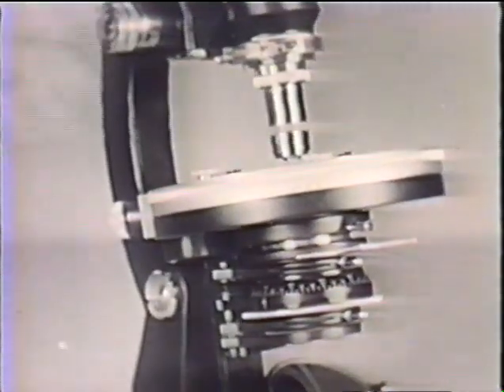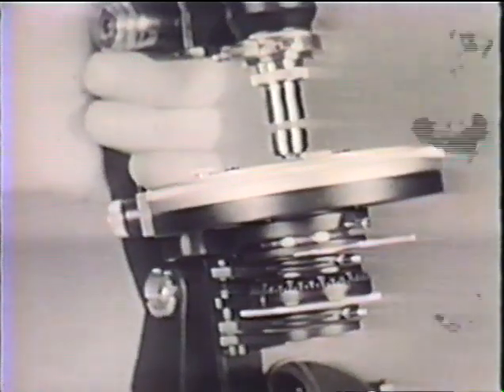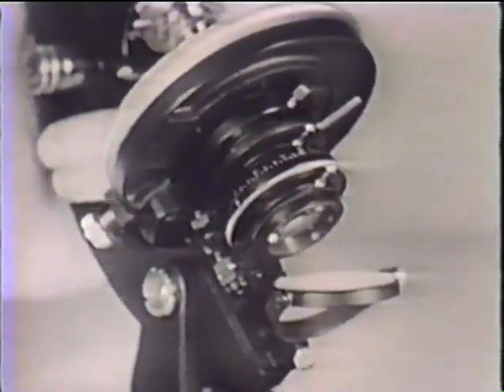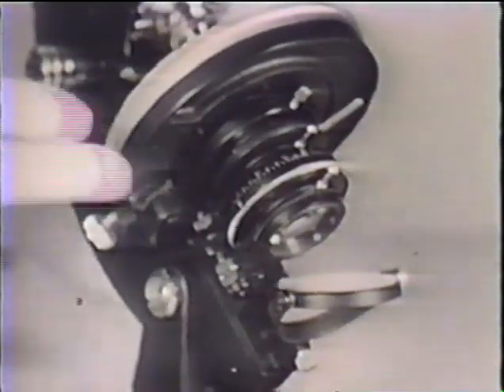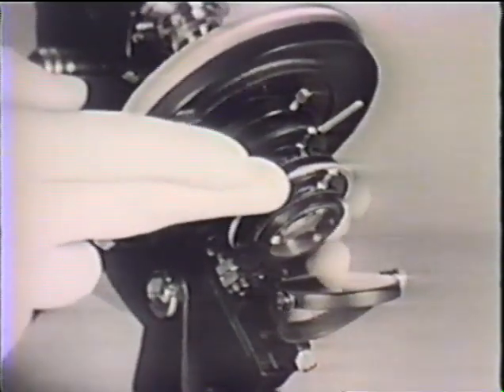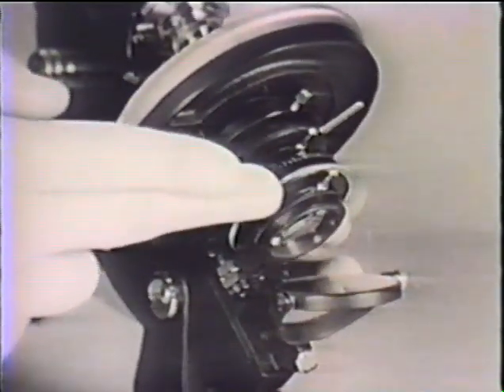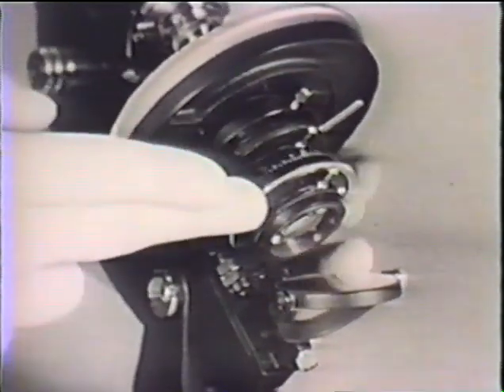To adapt a microscope for polarized light, we must provide a polarizer mounted below the stage through which the light must pass before reaching the object. The mount can be rotated to vary the vibration direction of the light. For Cook instruments, it's set to transmit light vibrating east-west.